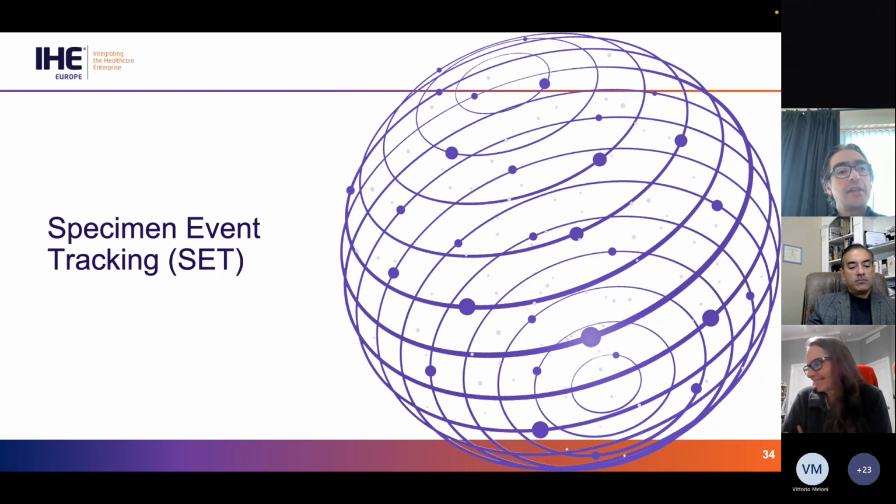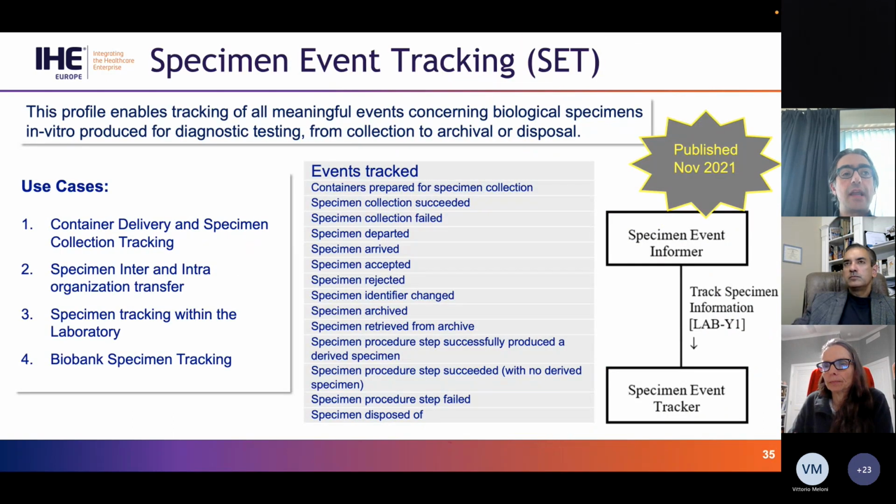About another new project, a new profile that we have developed since a couple of years, which is the specimen event tracking profile.